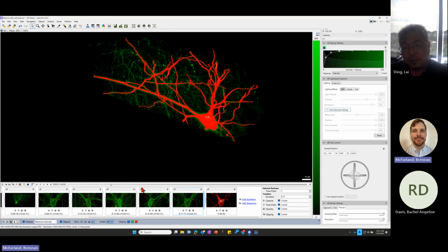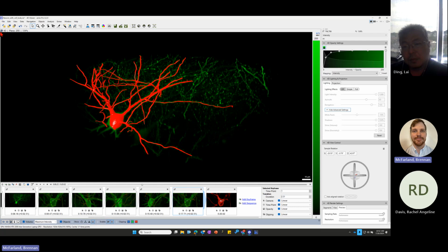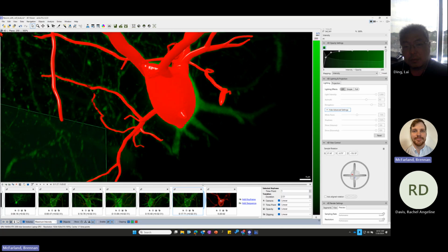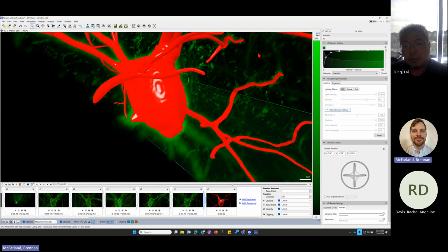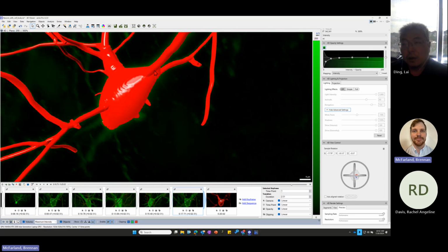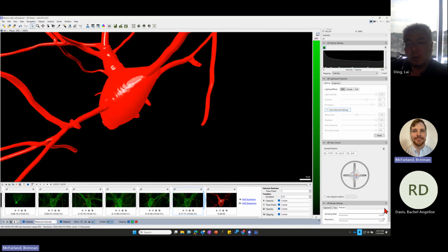and then if we wanted to export this as an actual movie, we could do a screen grab, but it's probably not going to be the best result because we're just taking in whatever we see on the screen here. It's a little jagged, it's not smooth. Part of that is because I don't create any keyframes. I just wanted to record what I'm doing. We would have to build it through keyframes if you wanted to.